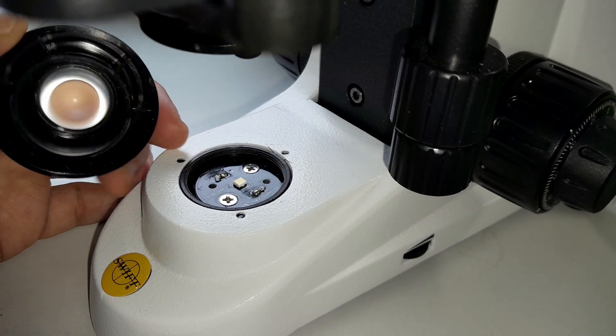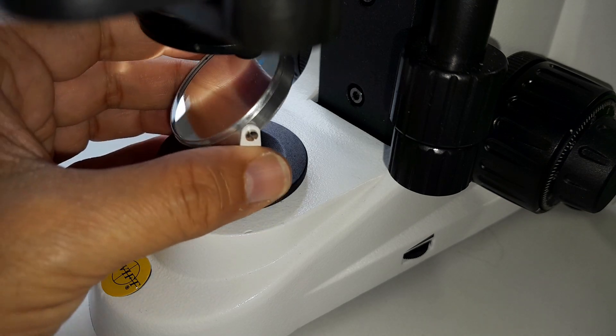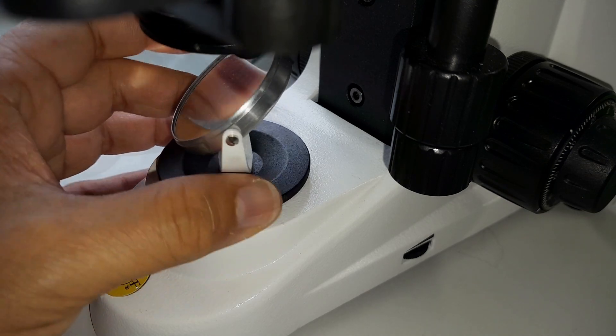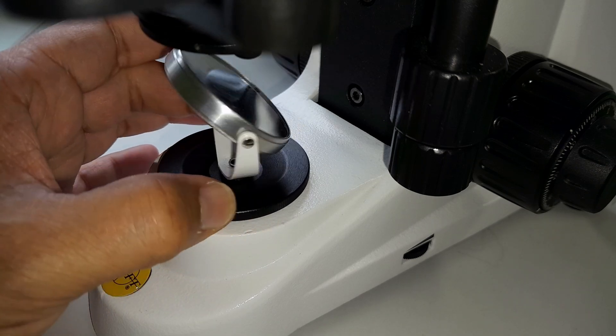Mounting the mirror only takes a minute or so. It's quite easy. You first have to remove the plastic cover of the lamp. This one also contains a little lens. And then you have to screw in the mirror. And then we're ready to go.